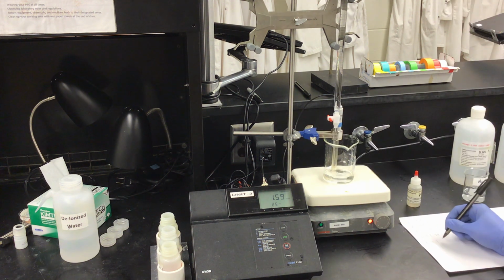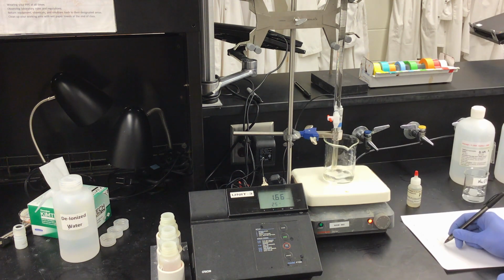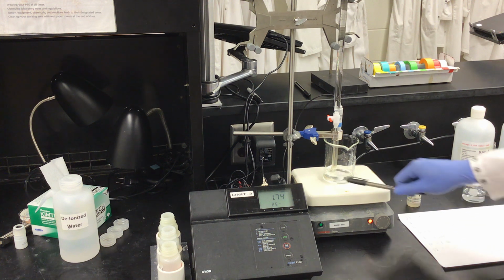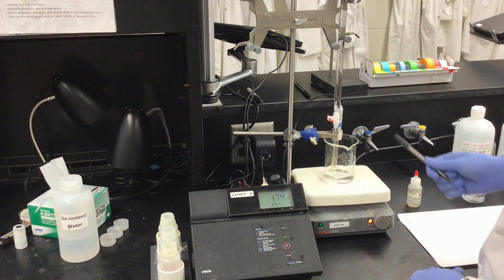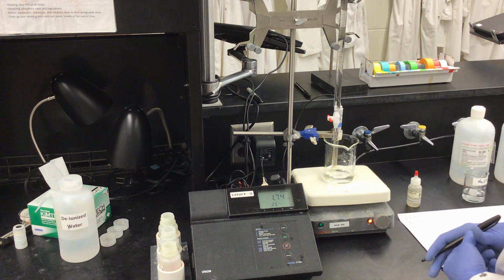At 8 milliliters, we have a pH of 1.59. At 10 milliliters, we have a pH of 1.66. I'm slowing down the rate at which I add my solution in order to be sure that I don't over-titrate my solution. If I over-titrate, I will not have an accurate measurement at the end, so I'm taking my time, since we do not know how much sodium hydroxide we will need to use to titrate our hydrochloric acid.